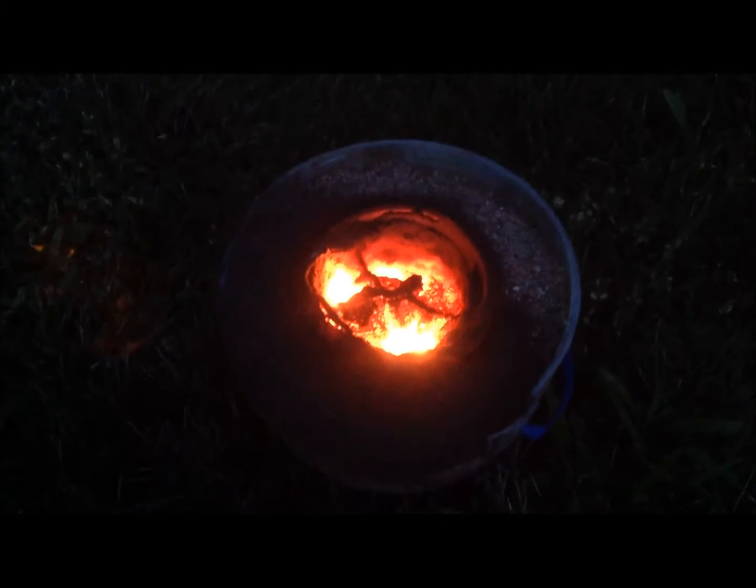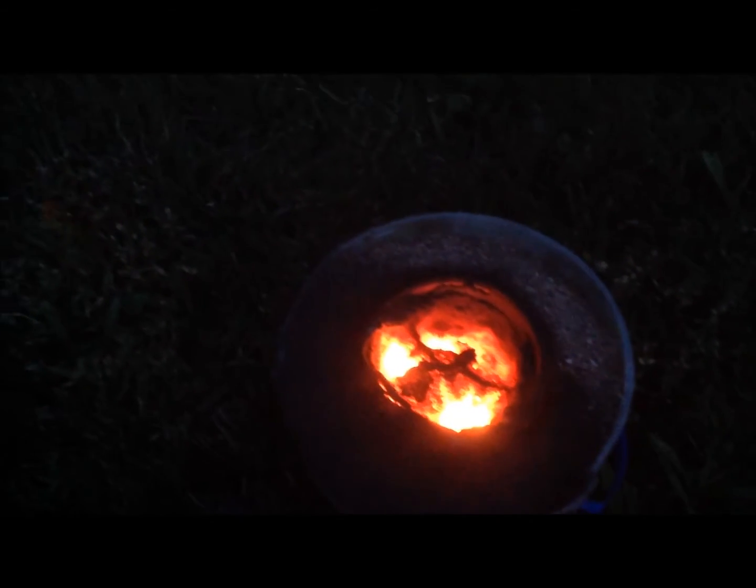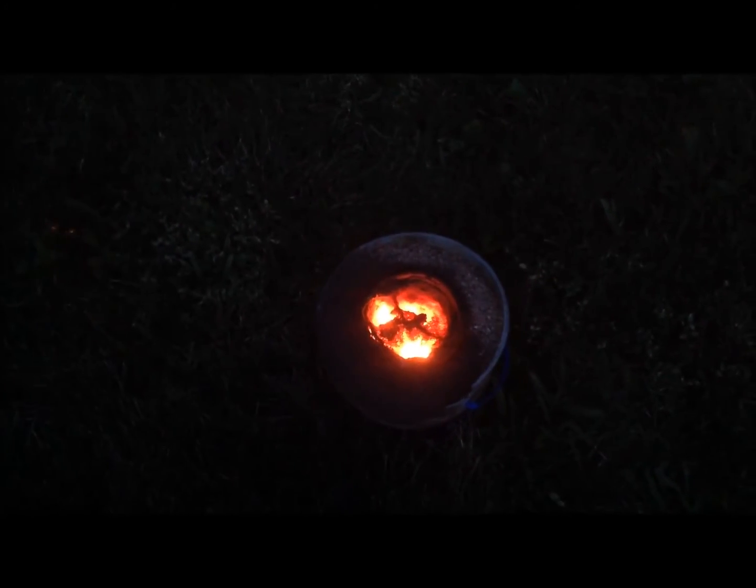Here's the glowing slag. As you can see, it is really not molten, which is a shame. I'll have to try again sometime, either with purified battery paste or with manganese dioxide from a pottery store.